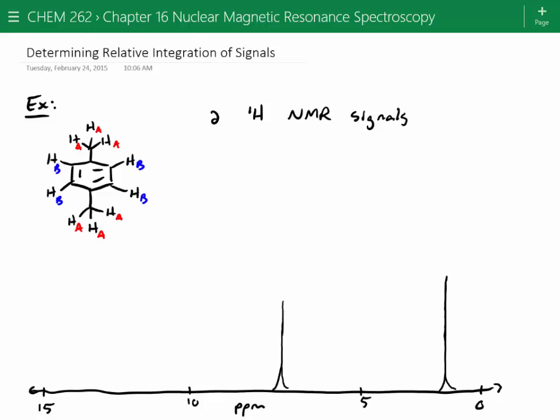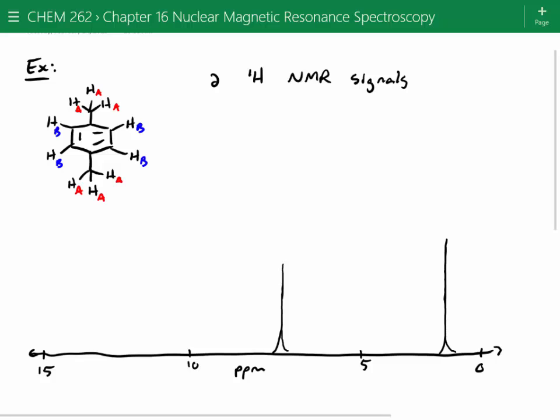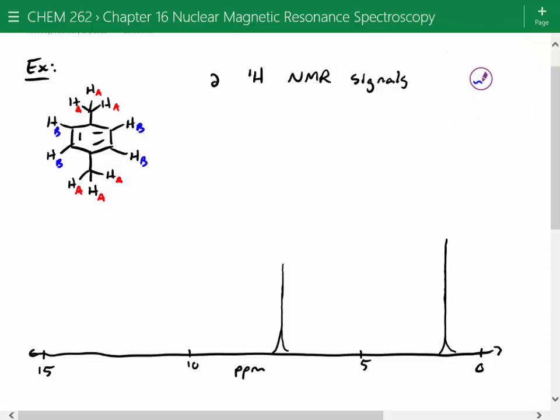And so when we get this spectrum, what we can do is actually tell the computer, I want to know the area underneath each of these peaks, right? So what we call this in spectroscopy is just integration. So similar to mathematics, we're trying to find the area underneath the curve. And so what the computer will do is it will split out a curve, and it will give you the area of the peak.